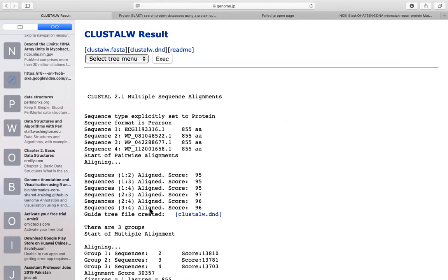We just need to execute multiple alignment. This is the result of multiple alignment. We have chosen the FASTA format. This is the output: the software tells us we have used multiple sequence alignment, sequence type is explicitly set to protein, sequence format is Pearson/FASTA. Sequence 1 had its accession number and length of 855 amino acids. Sequence 2 has its accession number and its length.